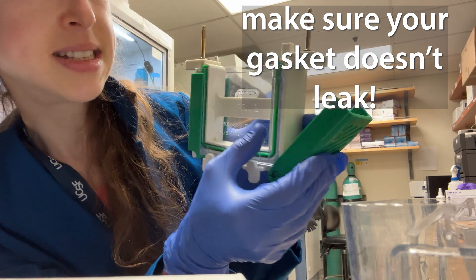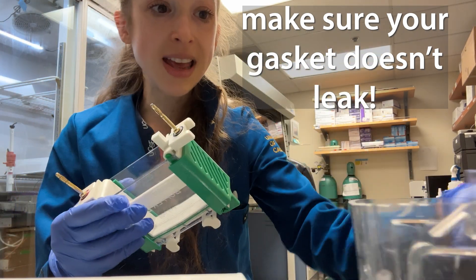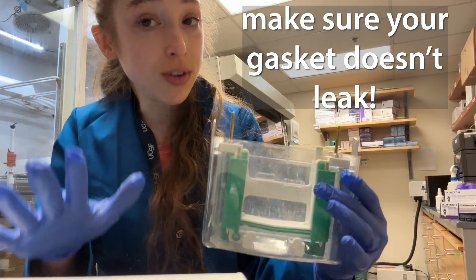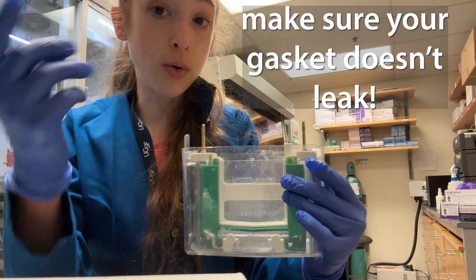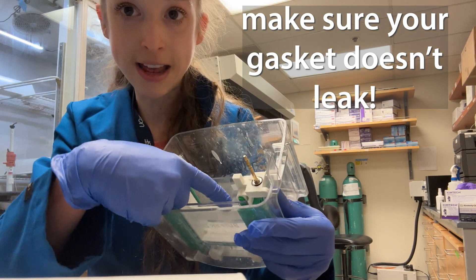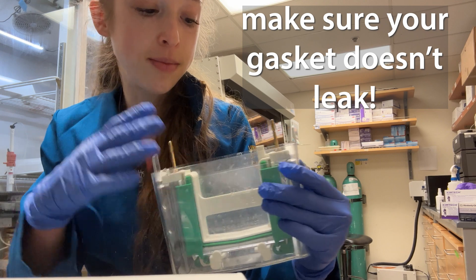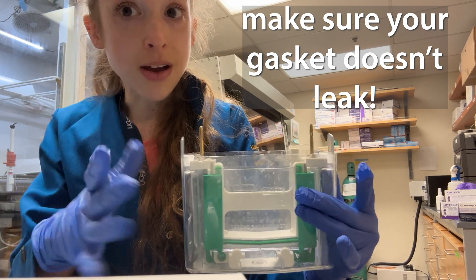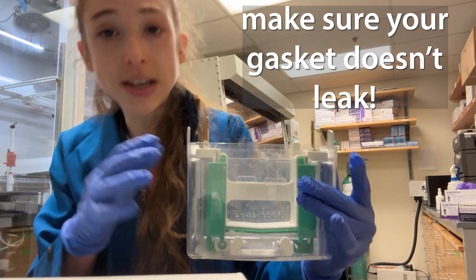Pull it tight, snap together the sides, and then — and only then — stick it into your gel box. In order to make sure it's really tightly snug, start by pouring buffer into the inner chamber you've just made by tightening the gasket. You want the liquid to stay in there. If the liquid starts leaking out, redo it. Once you've filled that up, check to make sure it's not leaking.